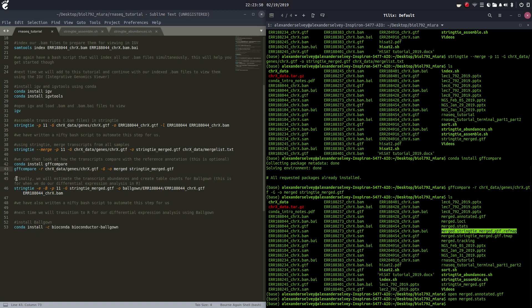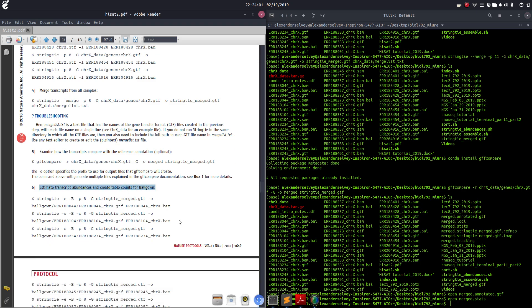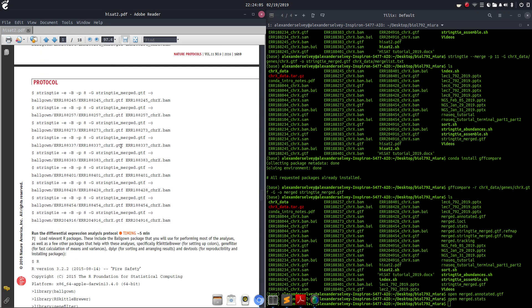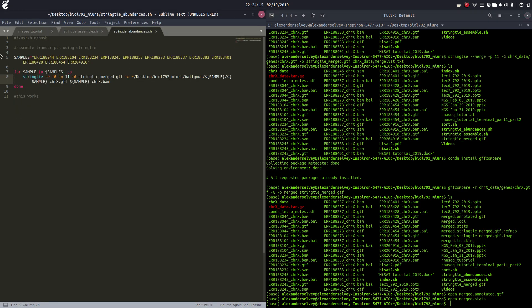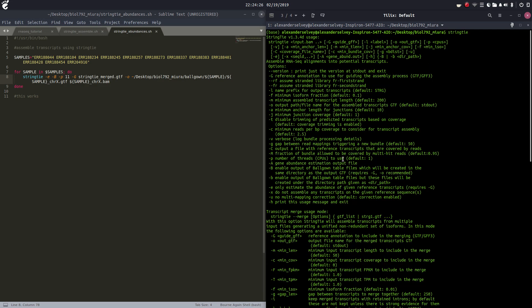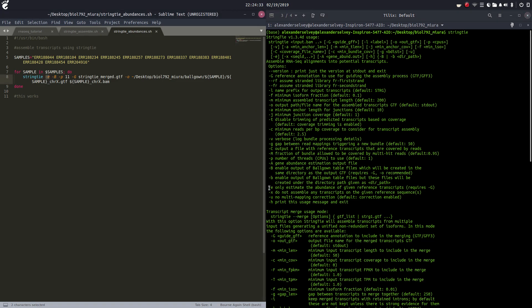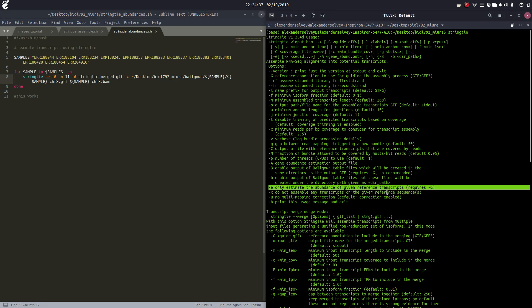Now let's estimate the transcript abundances and create table counts for Ballgown. They have you enter these one by one in the protocol, which is fine, but personally I like to automate things. I've created another bash script that will automate that entire exercise for us. Looking at the StringTie manual: dash-e means only estimate the abundance of a given reference transcript - requires dash-G. Dash-B enables output of Ballgown table files, which will be created in the same directory as the output GTF - requires dash-G. Dash-o is recommended. Dash-p is our number of threads.